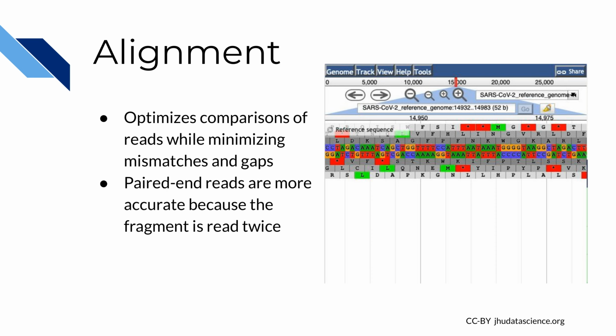In the lab exercise, we'll be using paired end reads. Paired data is made up of fragments that are read twice, forward and reverse. Paired data helps improve data accuracy.